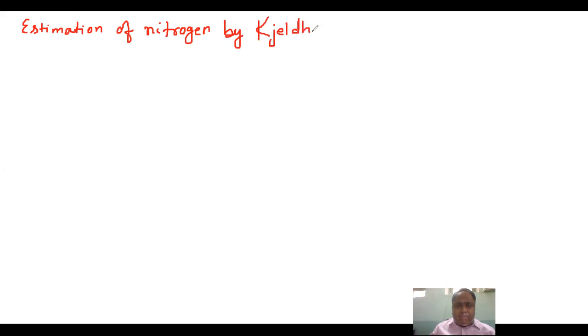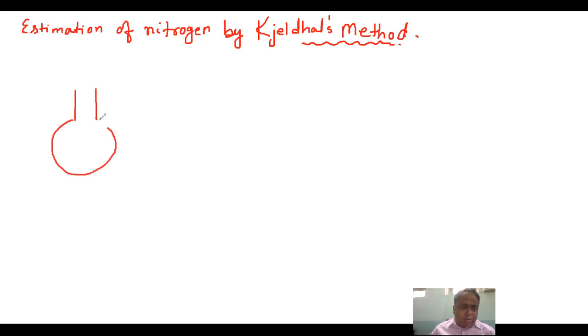Estimation of nitrogen by Kjeldahl's method. In this, whatever organic compound is there, any organic compound.